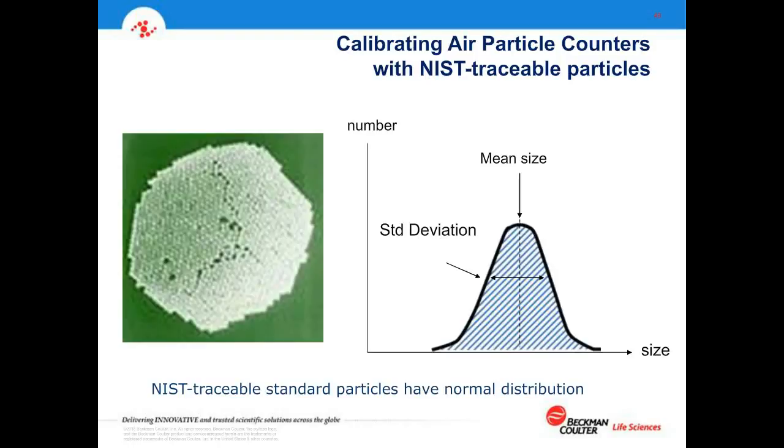Well, how do we know it's seeing particles of a certain size? How do we evaluate that? What form of tests and so forth do we use to both design and to use this type of instrument? Well, that's where the calibration document comes in, and again, 21501-4 as an international document gives us a good base to establish a method.